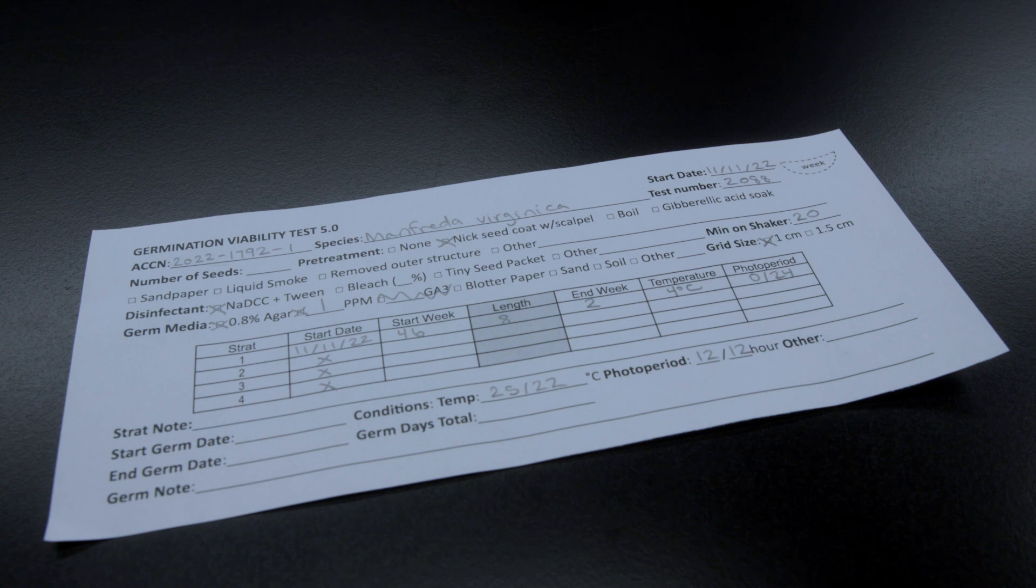After I've decided how I want to run the test, a score sheet is filled out. We've found that having a physical copy that stays with the test is really helpful. It's pretty self-explanatory. There's a space for a session number, taxon, and test number at the top.